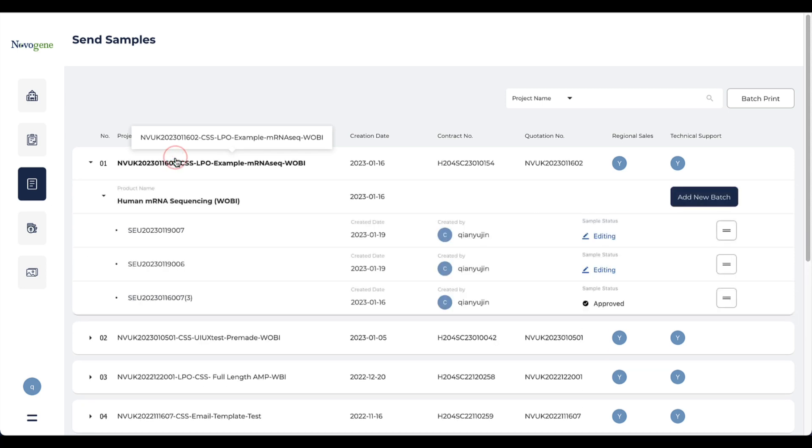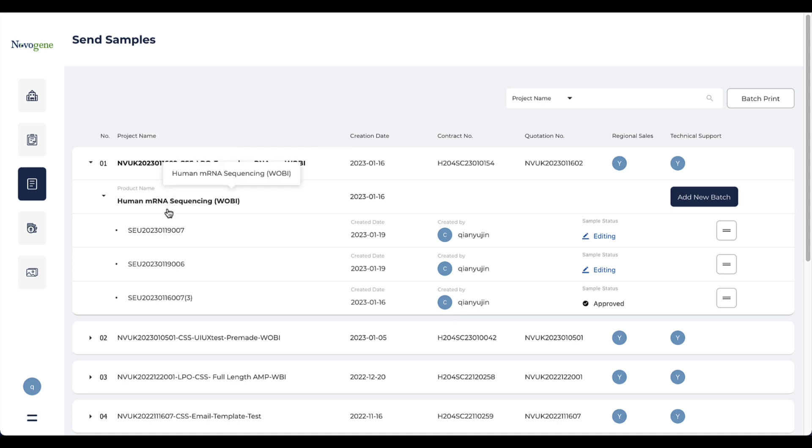When you click the project bar, the drop-down page lists all batches created before, including the batches you submitted already or uncompleted batches marked by different status. You can continue to finish the editing of batches at any time you want.